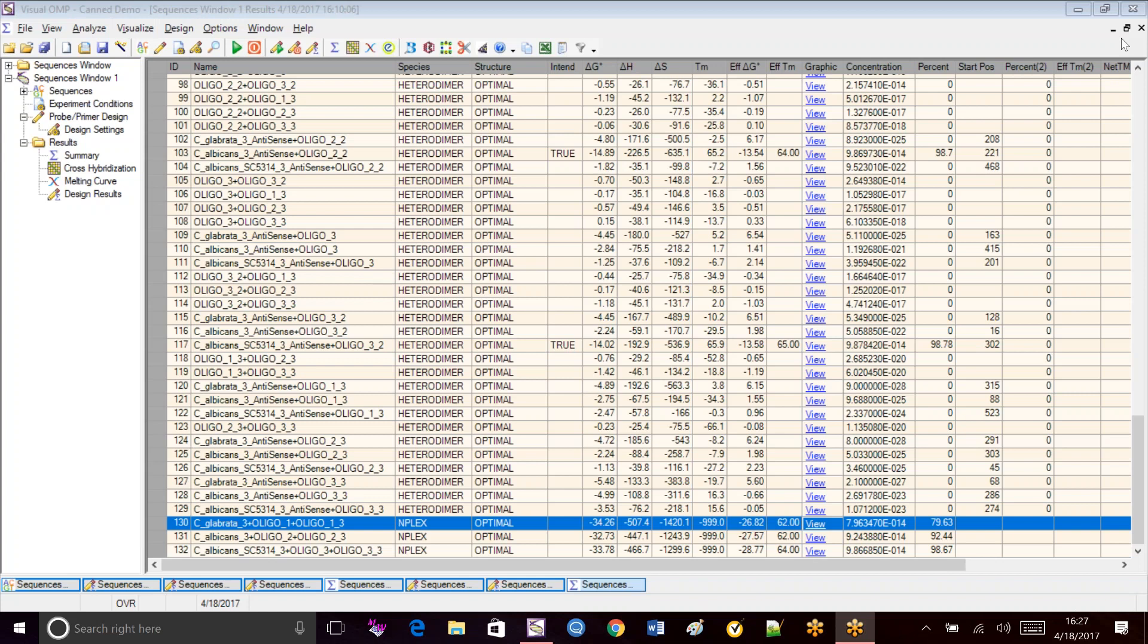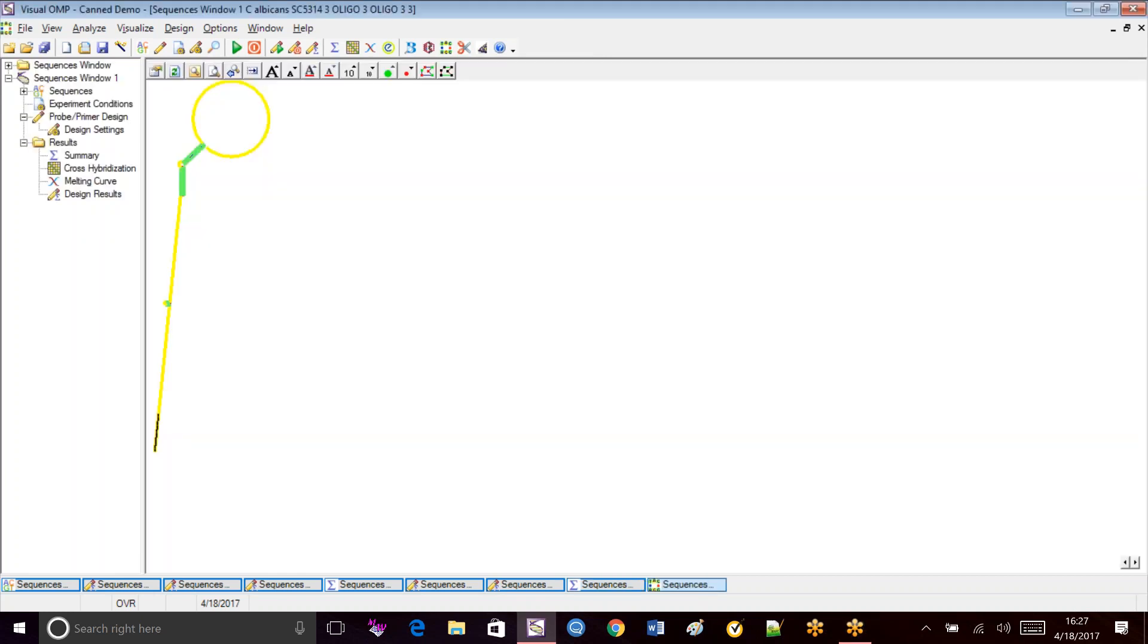So these are the results that we have from our multiplex primer and probe design. And we notice the N-Plex here. We have a nice one right here. It's the Albicon variant.